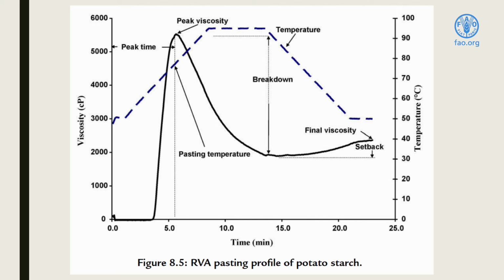Pasting temperature means, oh, here is some error. This is not the pasting temperature. Pasting temperature is this one. That means the temperature at which viscosity starts to increase. So in this case, the pasting temperature is around 70 degrees C.